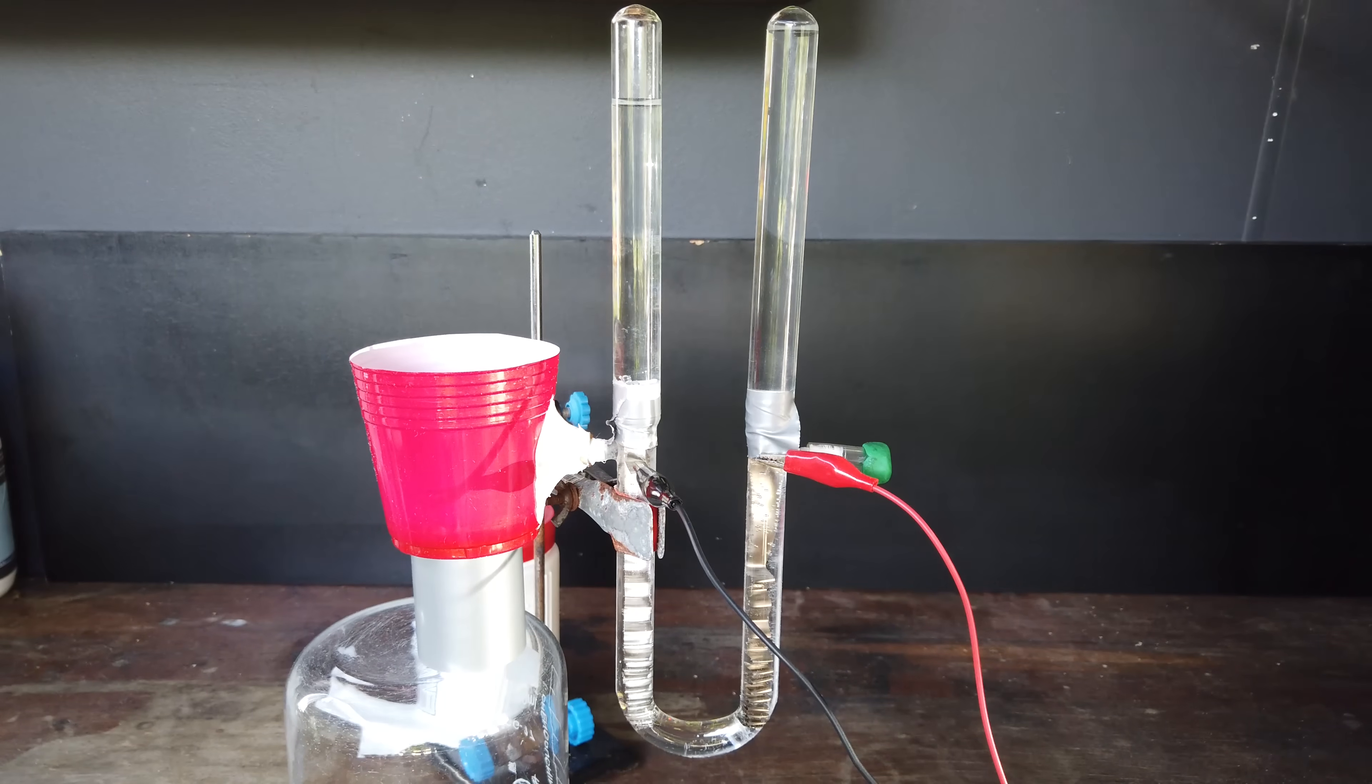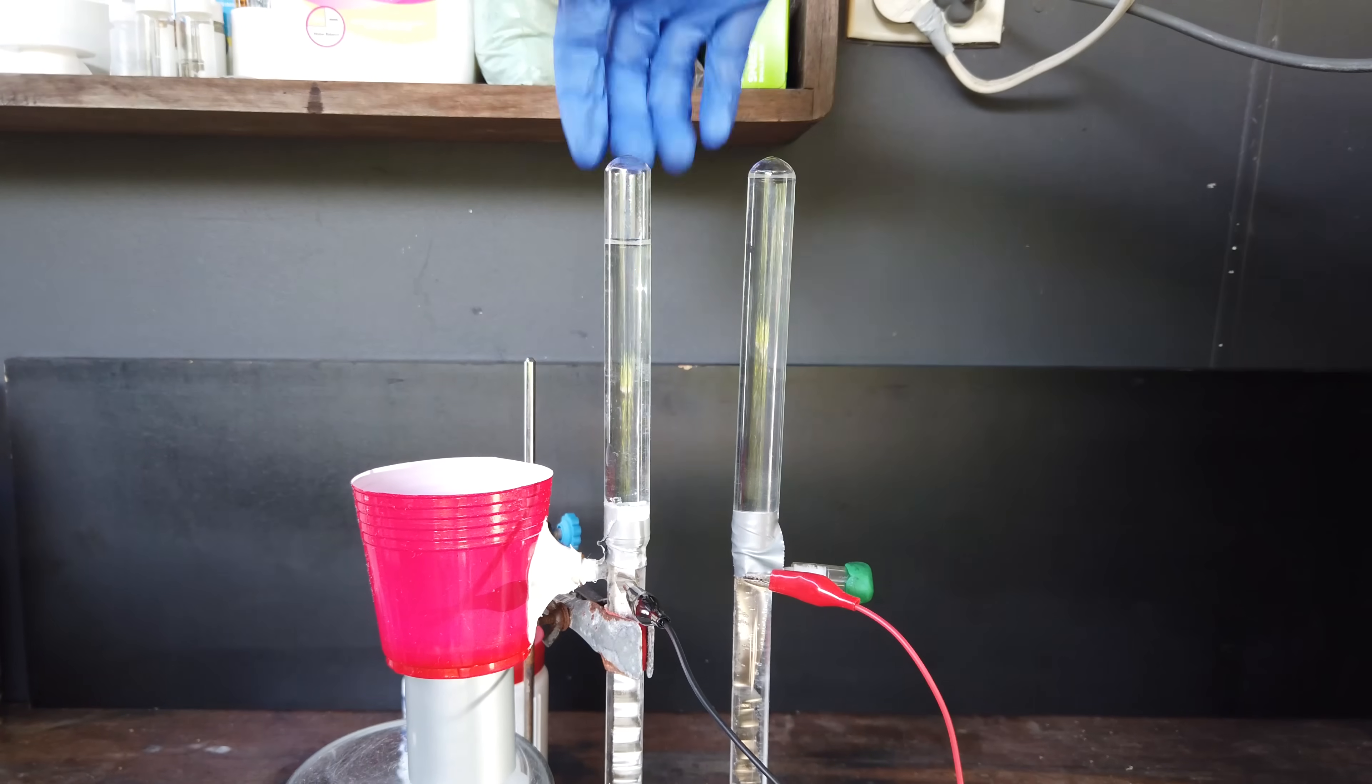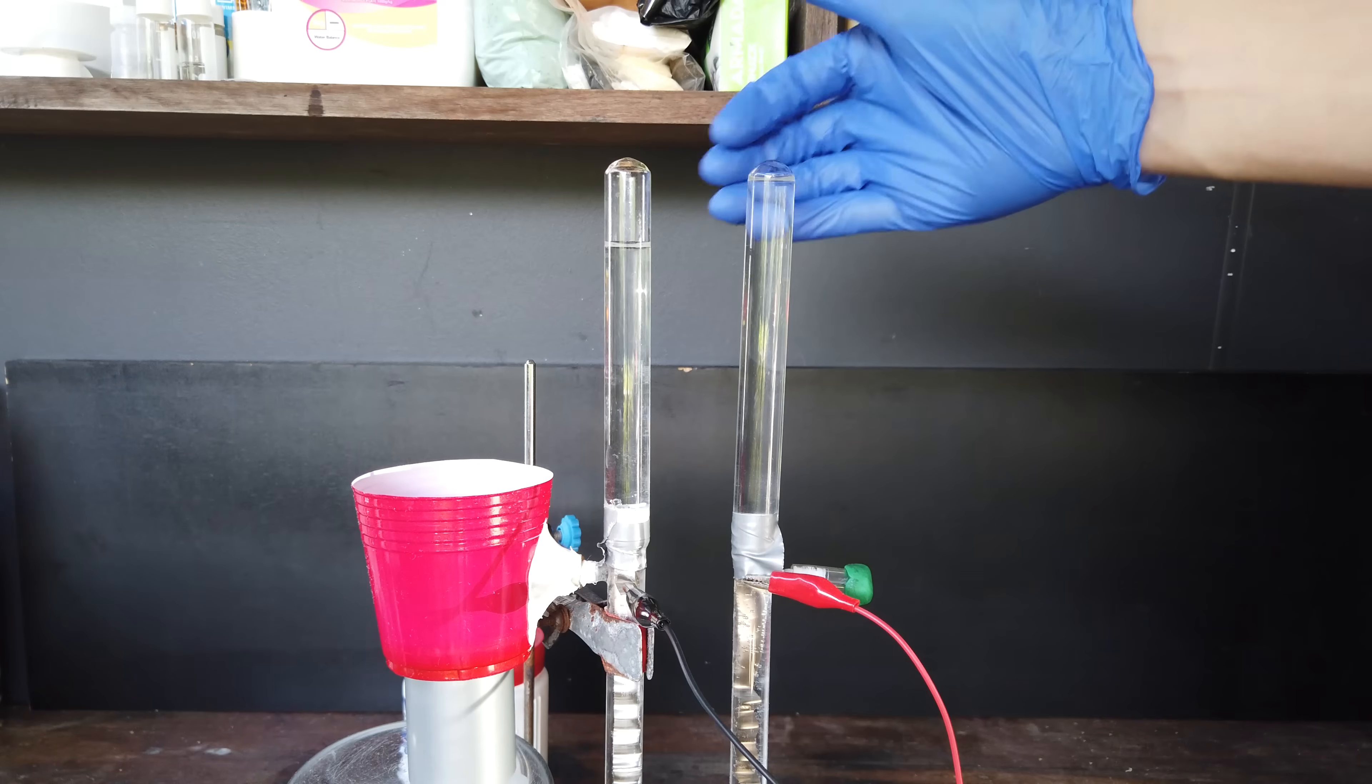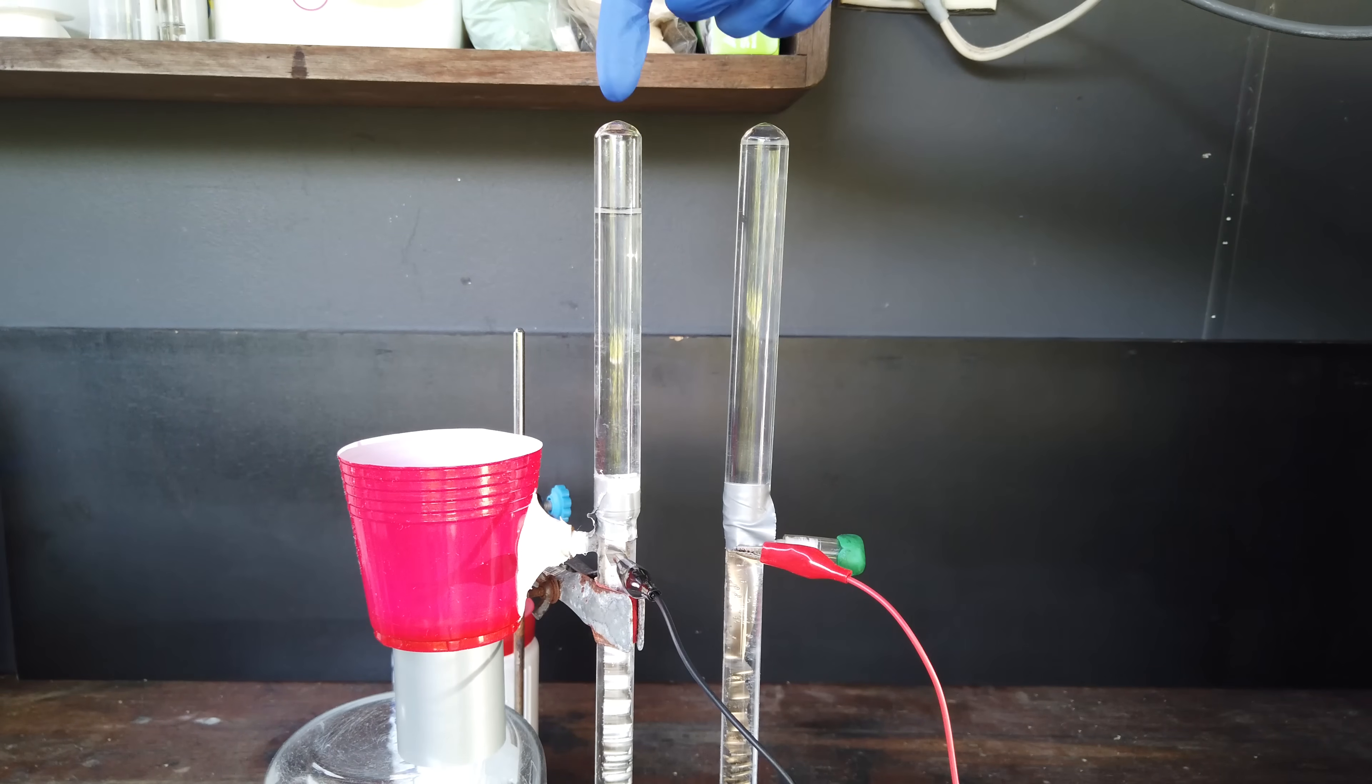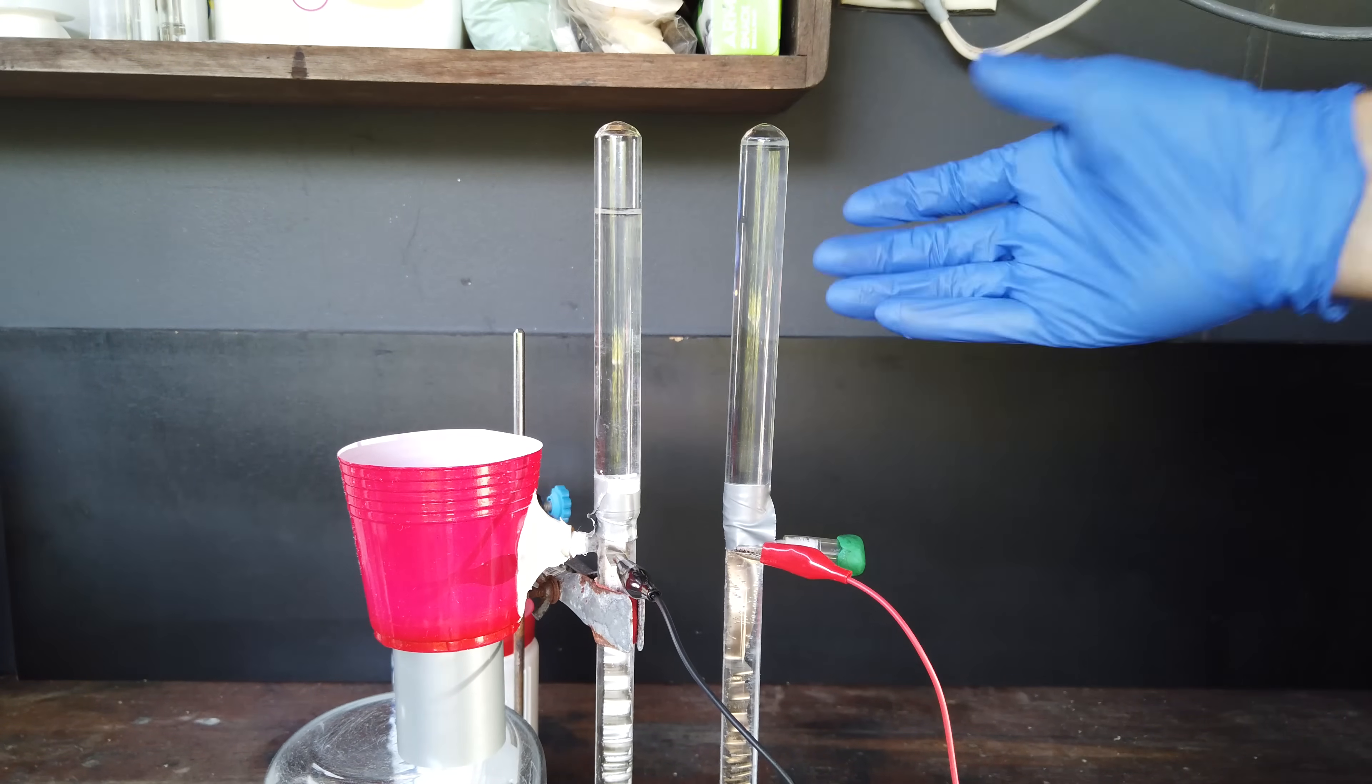So yes, after 24 hours of electrolysis, we have made this much hydrogen. I'd call that maybe 5 to 10 milliliters. And then this much nitrogen, which you can barely see. The gases aren't quite in their 3 to 1 ratio. We expected to see 3 units of hydrogen and 1 unit of nitrogen after we completed our electrolysis.